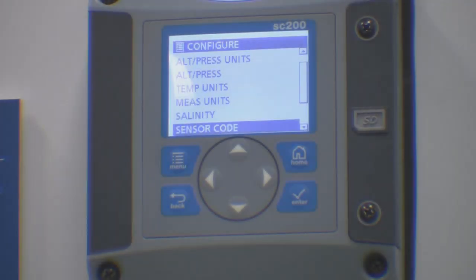If the sensor code is entered incorrectly, sensor code invalid appears on the screen. At this point, please re-enter your code.